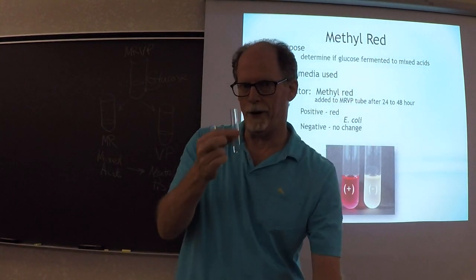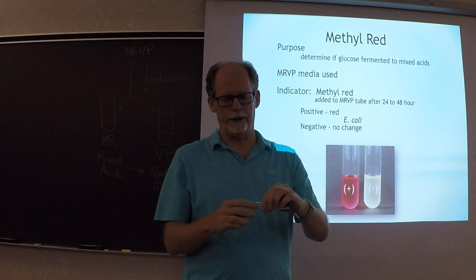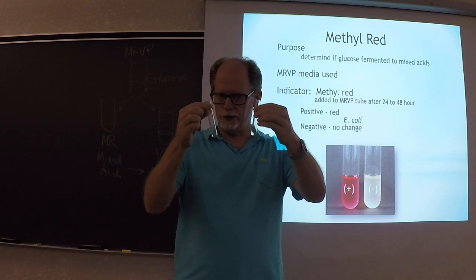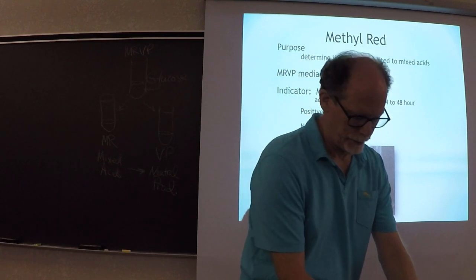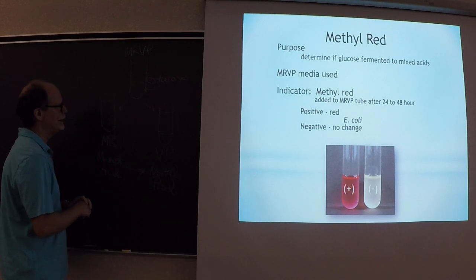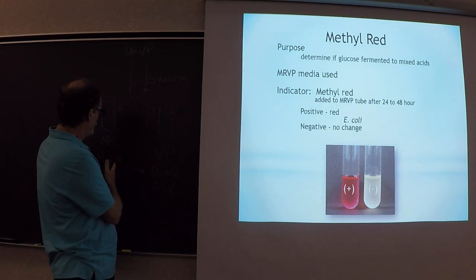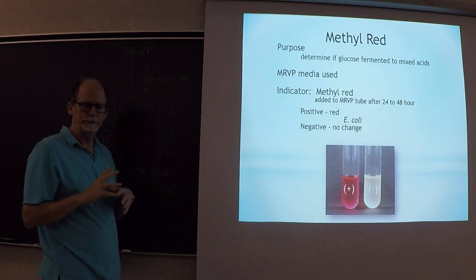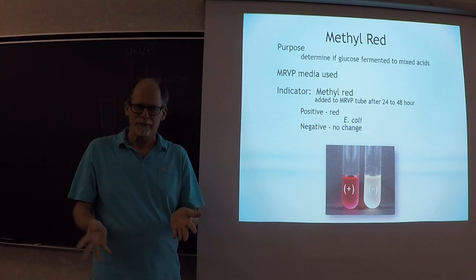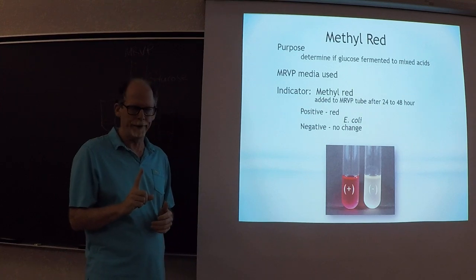So if I had the MRVP tube here, I'd inoculated it, the bacteria grow. In the following lab, we split the tubes in 2. The same media is used to do the MR test and the VP test. So to do the MR test, which I'm explaining here, if the bacteria fermented the glucose and converted it to what's called mixed acids, there are many different types of mixed acids.